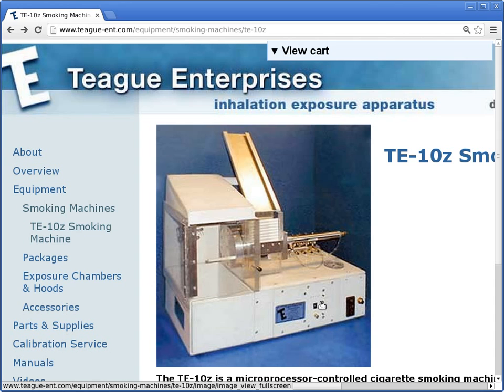All it really does is just smoke the cigarette. It doesn't even know whether the cigarettes are lit correctly. But since this particular model, the hardware has not changed since I think '98, so the past 14 years, the control unit, which is this little panel here, has gone through 2 revisions. This is the original revision. The second revision, I made out of existing parts, and then the third one, I actually custom designed a printed circuit board to do it.